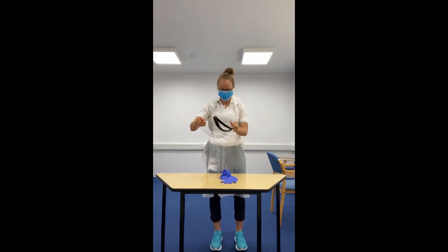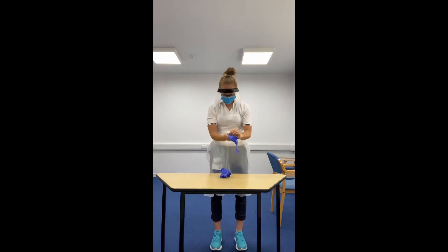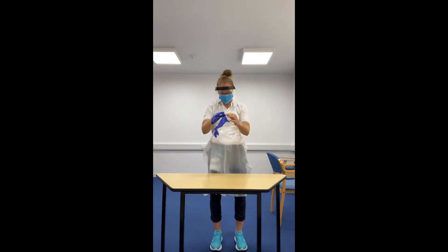Once these are in place, we don't want to be touching our face again. We then want to be putting on the gloves, one on each hand, and once the gloves are on we don't want to touch anything at all.